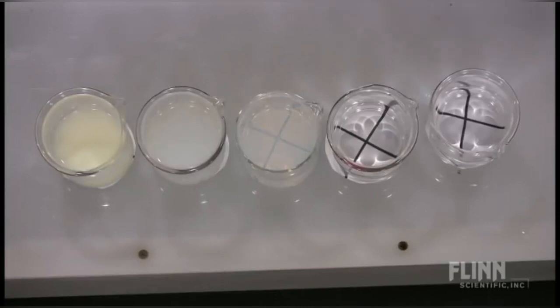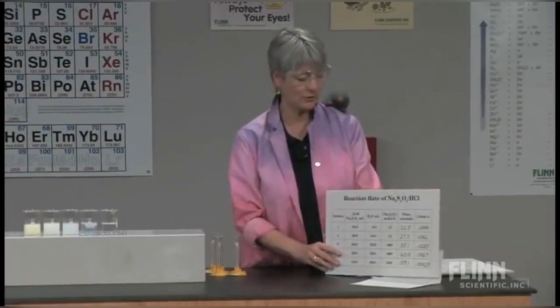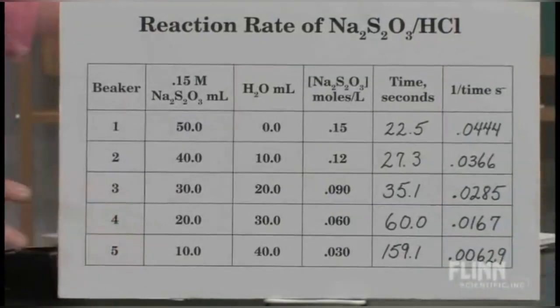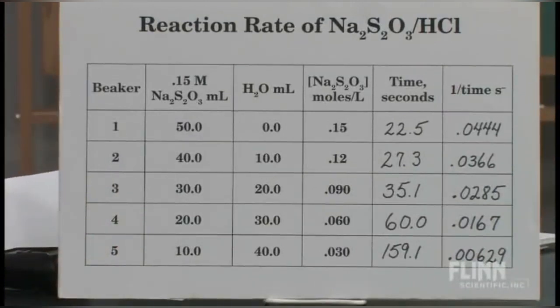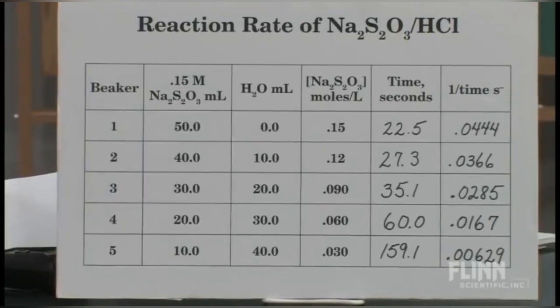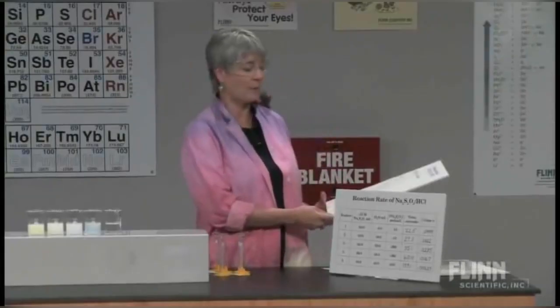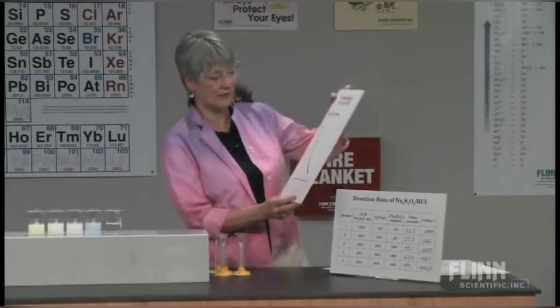Let me show you what the data would look like for something that I did do in my classroom. We'll do a cooking show approach to this. This is some actual data that my students gathered. And you see that in this case, their initial one was 22 seconds, and their final one was almost 3 minutes. All right. We're going to look at the graph if we plot the concentration versus time.